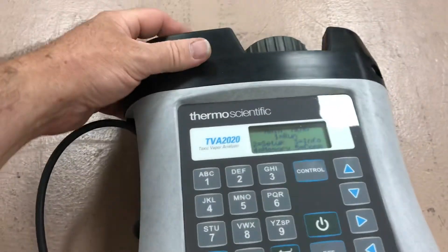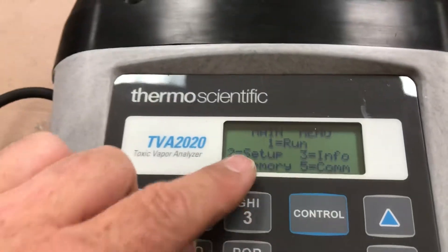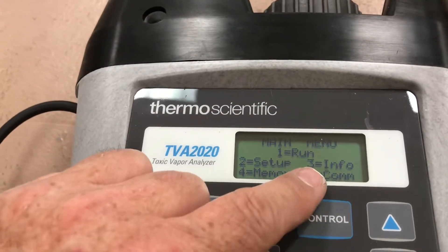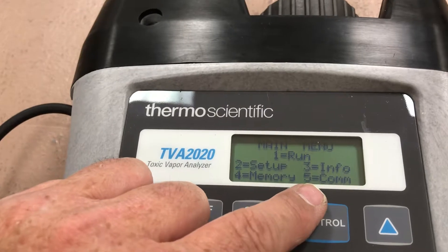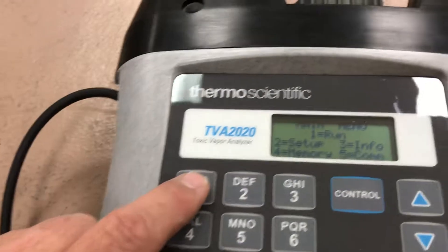You can lay it down. I've already got it powered up — the power button is here. The main menu looks like this: we have Run, Setup, Info, Memory, and Communications. To start the unit, simply hit 1 for Run.